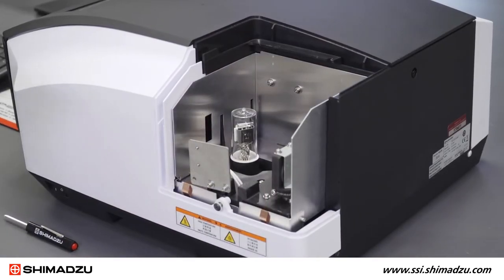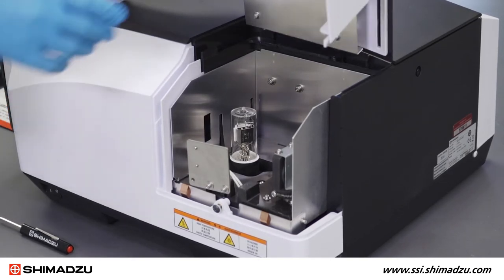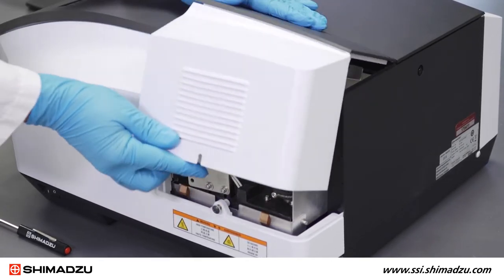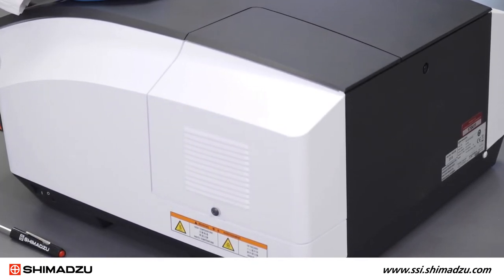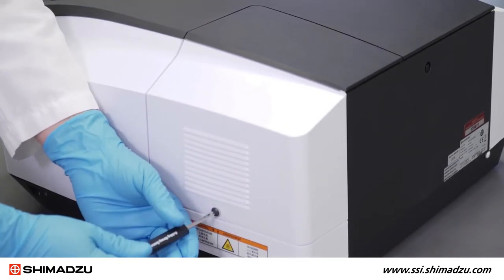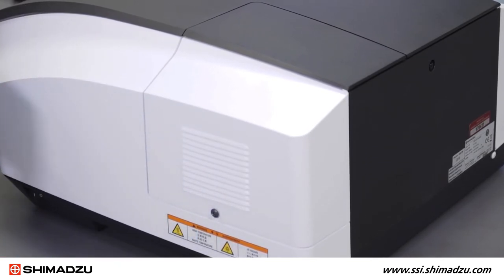Once both lamps are replaced, you can close the lamp compartment. Place the top of the lamp compartment lid against the main body of the instrument and lower the bottom lip of the lid inside of the lamp compartment screw. Using the Phillips head screwdriver, secure the lamp compartment lid to the main body of the UV-Vis spectrophotometer.